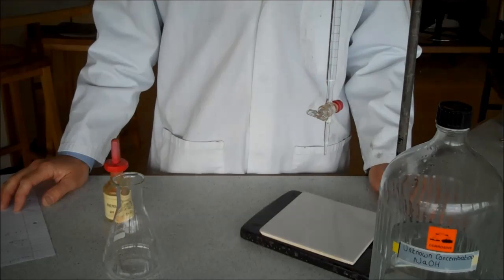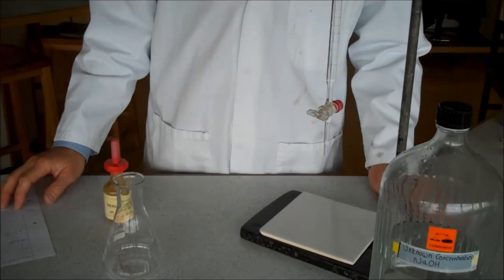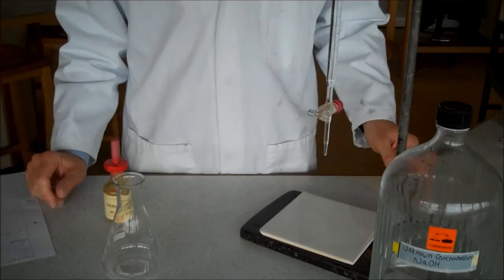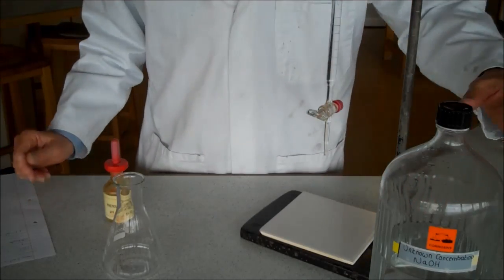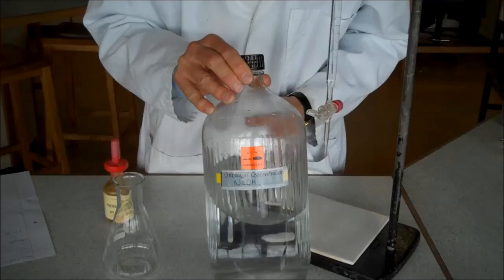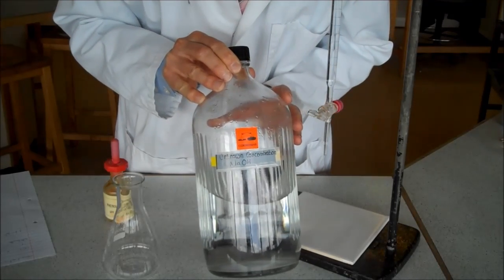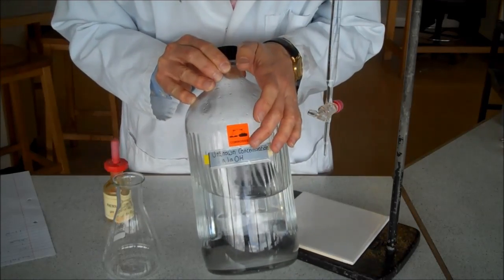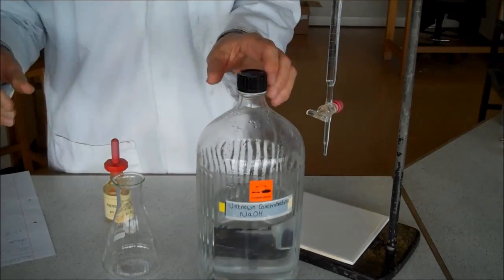This is how to carry out an accurate titration of an unknown solution where you want to find out its concentration. We're dealing with an unknown solution of sodium hydroxide. Notice it says corrosive, so we've got lab coat and goggles on.